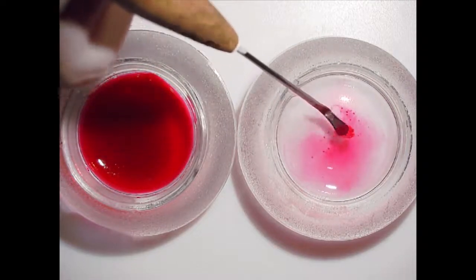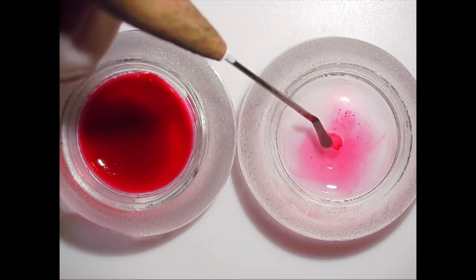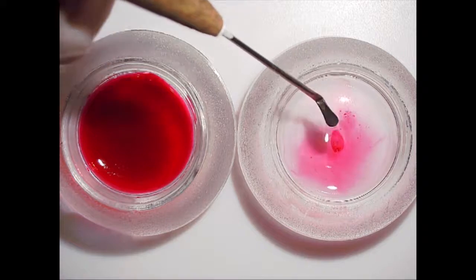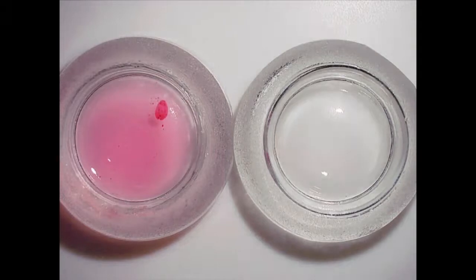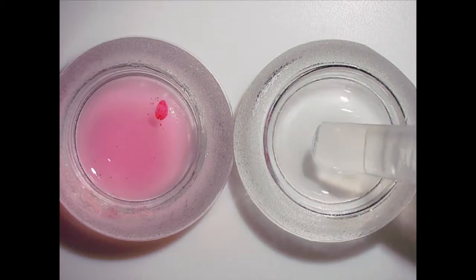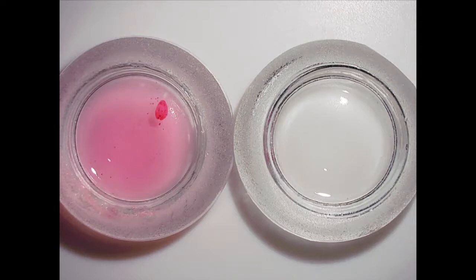Most of the stain is out of the specimen. As you can see, the stain is along the side. You'll also see some of the embryos and eggs in the dish. Our next step is also a dehydration step. This one involves 95% alcohol. Here I'm filling up the dish. You'll see the specimen still has a little bit of stain in it.